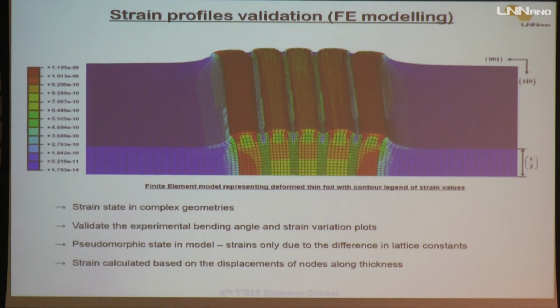So now I made some assumptions: for the split HOLZ lines, I assume that lattice plane bending is causing the split HOLZ lines, and for strain analysis I reduced the number of lattice parameters from 6 to 3 and tried to evaluate them. Now I need to validate whether my assumptions are correct or not.